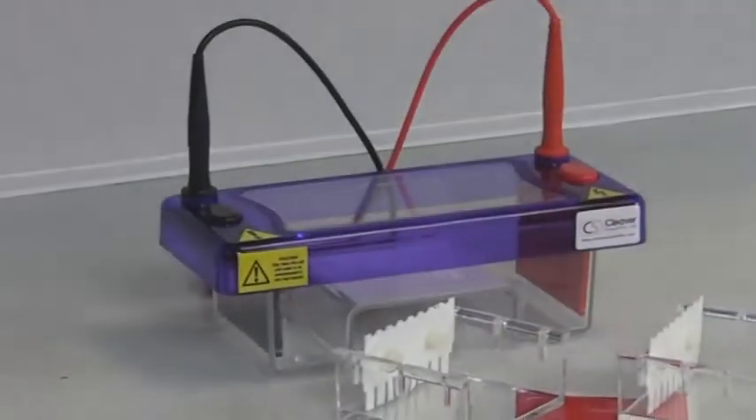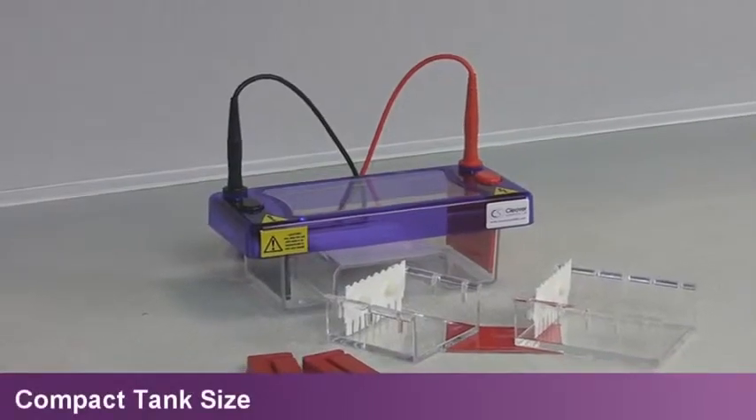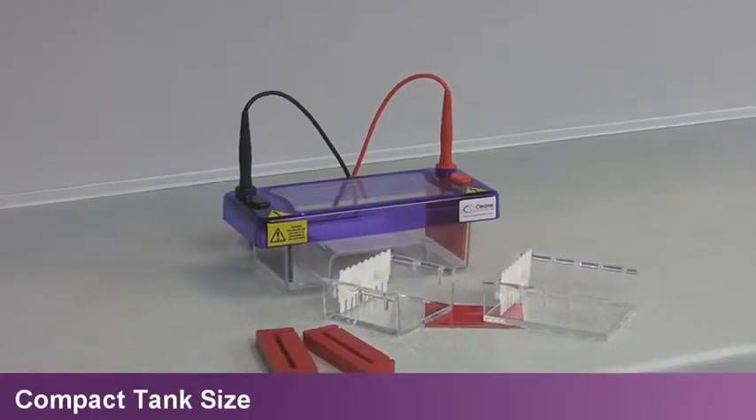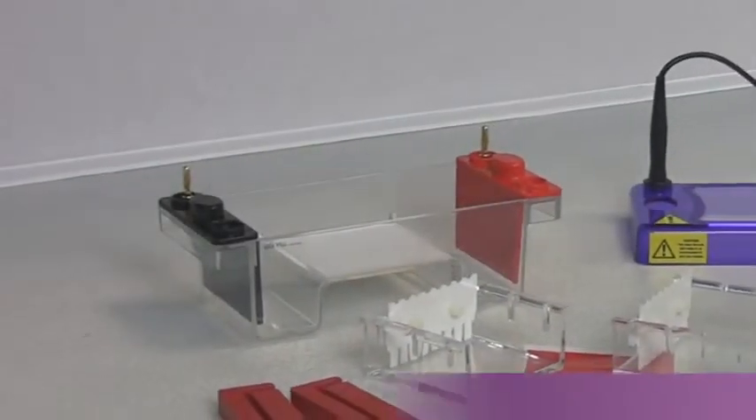Its compact tank size combines economical buffer and gel consumption without compromising resolution and separation speed. Each multi-sub unit has a high-quality injection moulded construction.